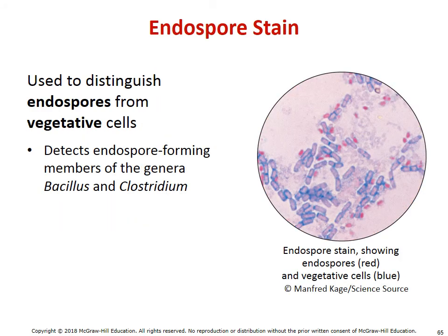The endospore stain is intended to show us an endospore. An endospore forms from a vegetative cell. I want to point something out. The word vegetative here is actually in reference to a living active cell. The inactivated cell we would actually refer to as being the endospore. So essentially, an endospore is a protective strategy that happens whenever a cell is in a dangerous situation and it wants to go dormant. There are really two major endospore forming genera, Bacillus and Clostridium. So you can see again the endospore initially develops inside, but the rest of the cell can die, leaving the spore to remain.